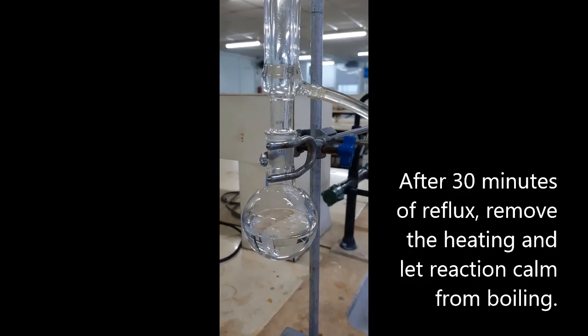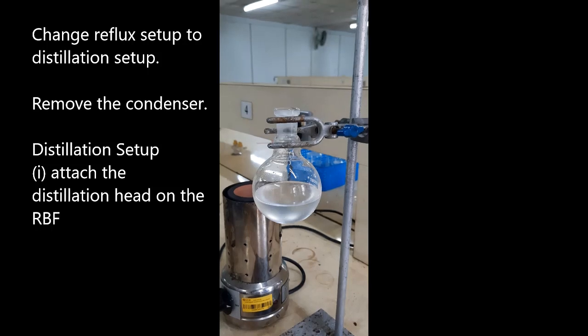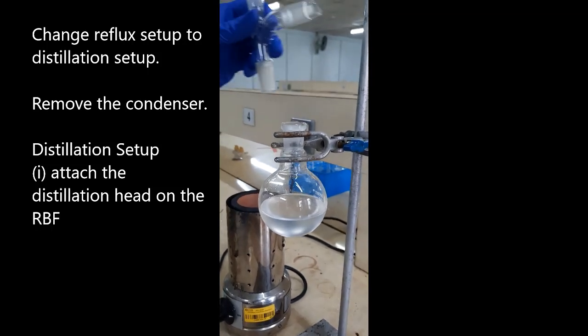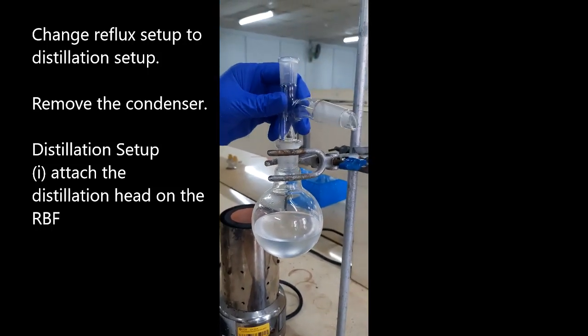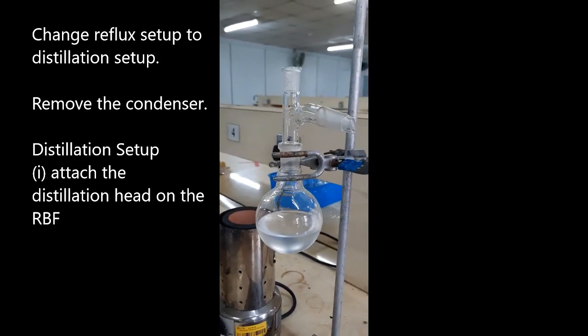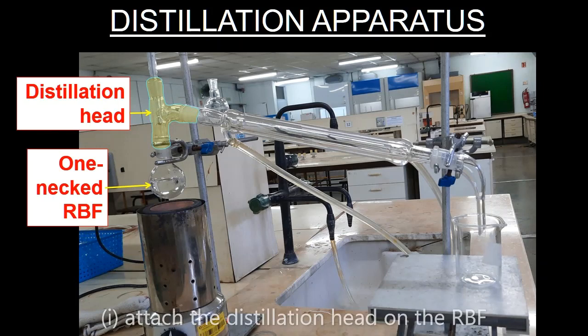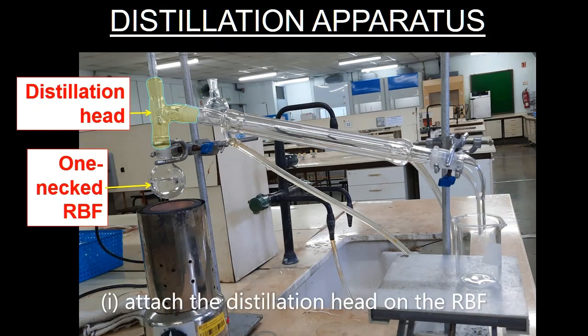Then change the apparatus to a distillation setup. Remove the condenser and attach the adapter to the round bottom flask. Follow the correct sequence of assembling a distillation apparatus. The assembly begins by attaching the adapter to the round bottom flask.